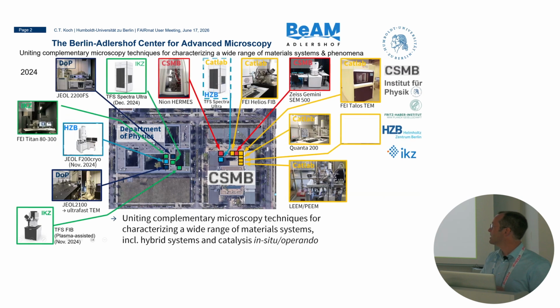I showed this already yesterday, but we're now in the CSMB building here, and the physics building is just across the little street next to it. There are a number of microscopes that belong to different labs, so there are different institutions owning and running them, but we want to have a common data strategy where we share all the experiences that we have, of course, with our own NOMAD installations, but also be able to share codes to analyze our data, and I will come to that at the end.